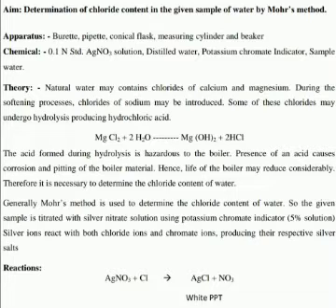The chemicals required for this experiment are 0.1 normal standard silver nitrate solution, distilled water, potassium chromate indicator and sample water. Theory related with this experiment: natural water contains many salts in the form of chlorides like calcium chloride, magnesium chloride, aluminum chloride, sodium chloride, etc. During the water softening process, if such chloride containing water is used, then it may introduce certain salts in the form of sodium, aluminum, calcium, etc.